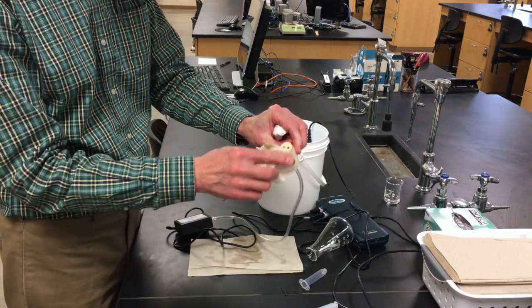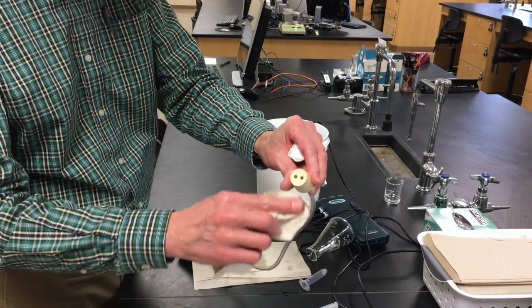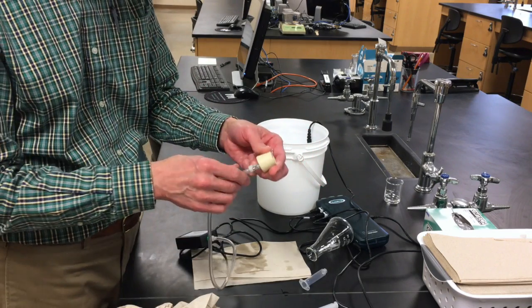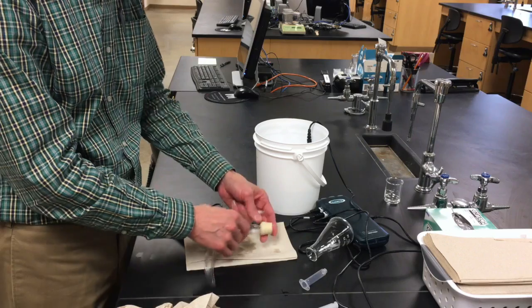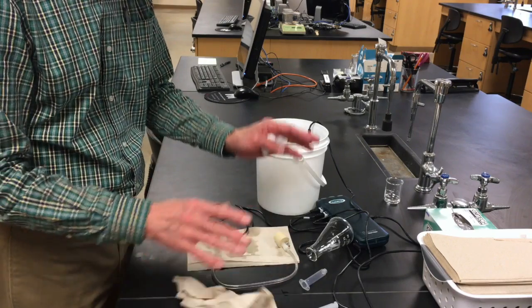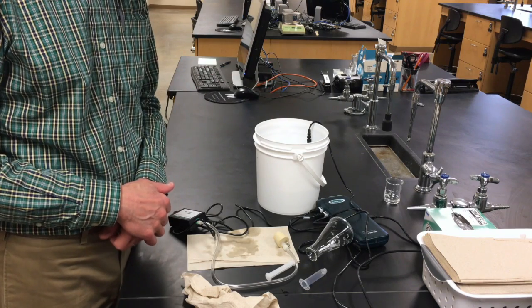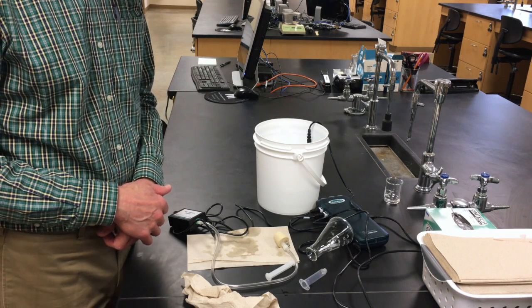There may be some ethanol on the bottom of the stopper, so wipe that off, and look through it, be sure everything is clean and dry. And again, wait a couple minutes before you reassemble everything to do your next liquid, and that will pay dividends.